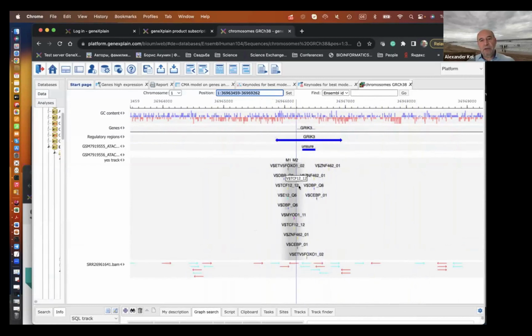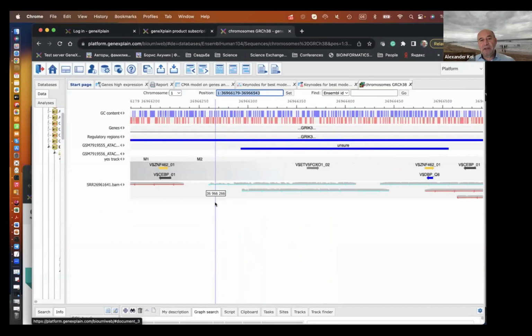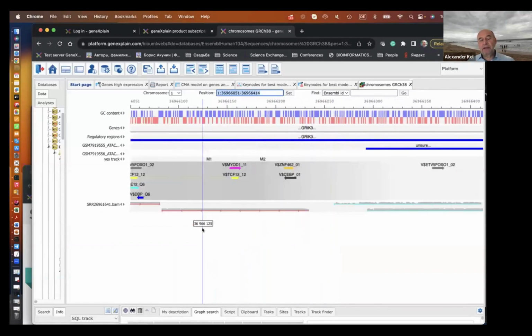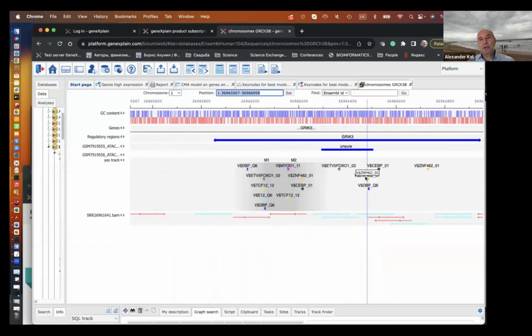So, and then we choose this region to analyze for the motifs, right? And exactly in the center of the peak, there are not so many motifs. So maybe that's exactly what happens when there is an empty place which is not occupied by nucleosomes, but occupied by these transcription factors. They also protect a little bit this region from this enzyme, and that's why the center of the peak is usually in a little bit of a valley of presence of motifs sometimes. And you see those motifs for the factors we were talking about.